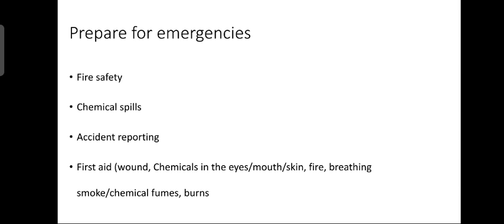It is a good practice that all employees should be provided first aid training and all should be familiarized with the use and availability of safety gadgets. Senior members of the laboratory should hold periodic safety audits on the proper function of safety gadgets such as fire extinguishers, safety fountains and eye wash stations.